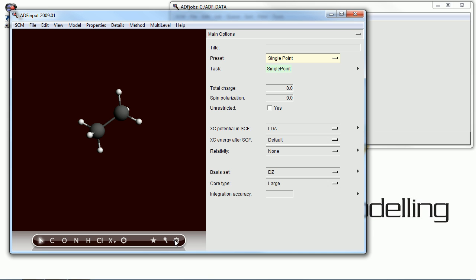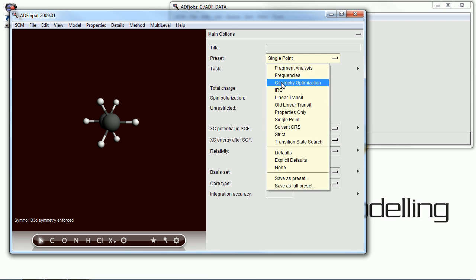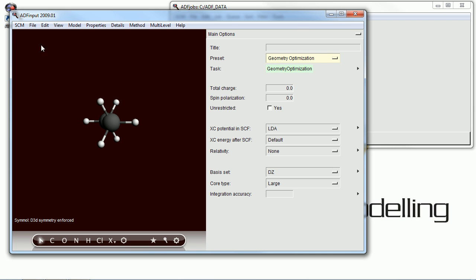We'll begin this tutorial just by drawing a molecule very quickly, pre-optimizing it, and checking its symmetry.